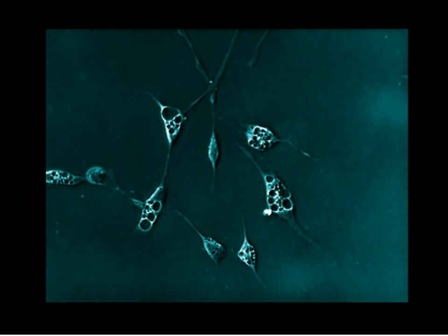As you will be seeing in the following movie, it's a time-lapse movie made using the Operetta screen, where we see that cells, after getting exposed to the compound, start to accumulate these vacuoles. And the vacuoles keep accumulating, and cells lose attachment, they round up, and then they burst. So if you look at the center of the movie, you can see one cell actually rounding up and bursting.